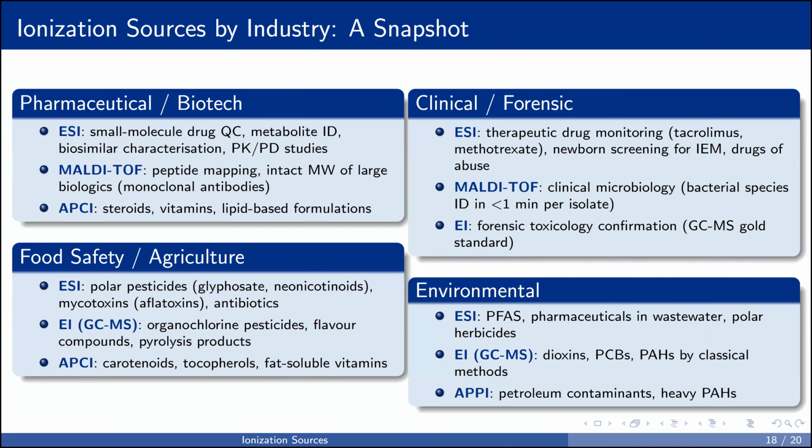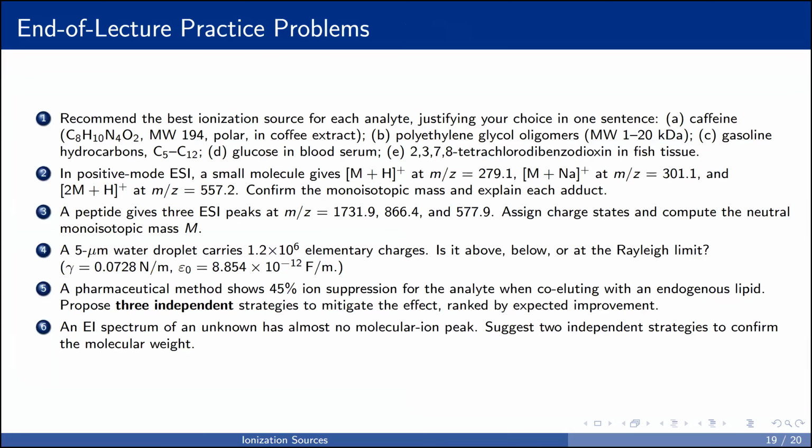Clinical and forensic, ESI dominates for therapeutic drug monitoring. Then going to environmental, we look at ESI for polar emerging contaminants such as PFAS, which has been a big story over the last several years.